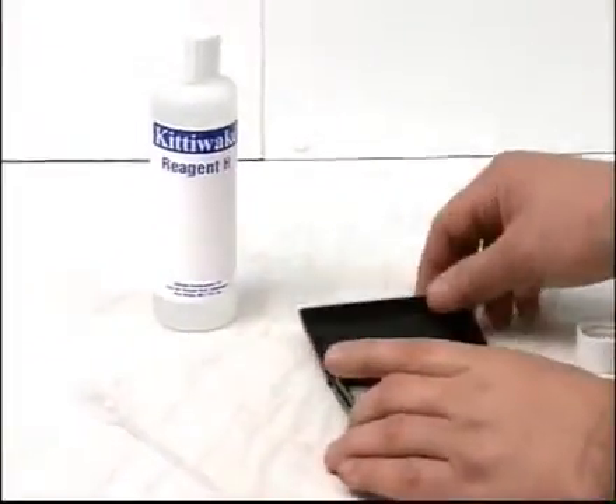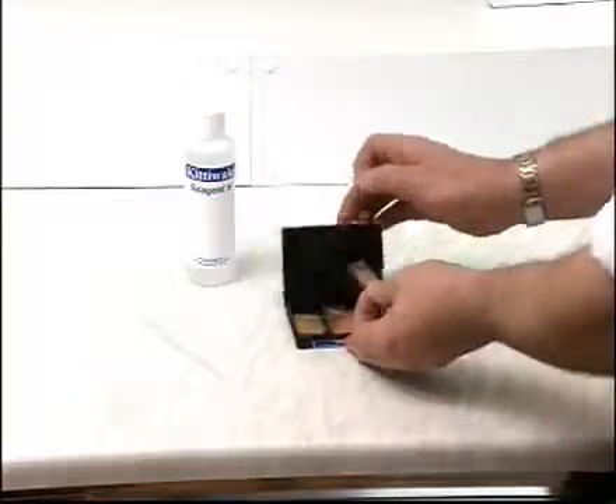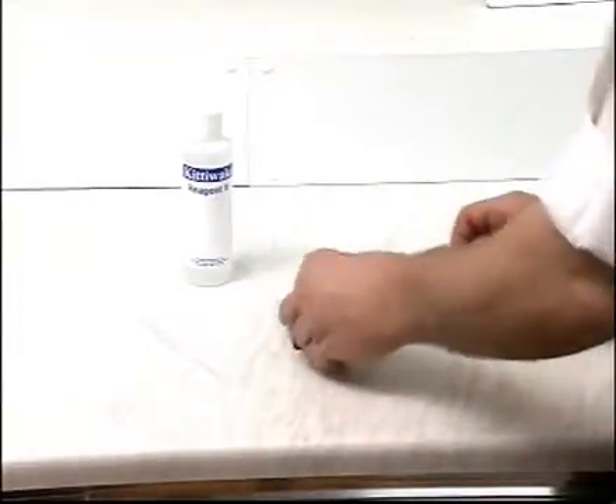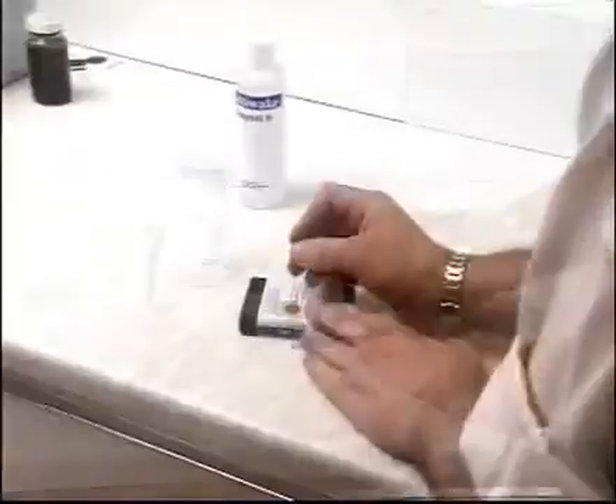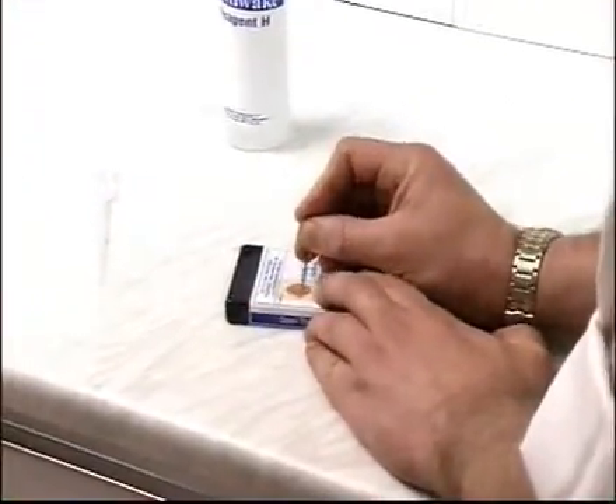Take a test pad from the box and replace the lid, being careful only to handle it by the edges. Using a pin, pierce it about ten or fifteen times in the center.